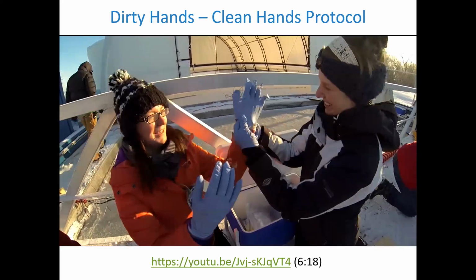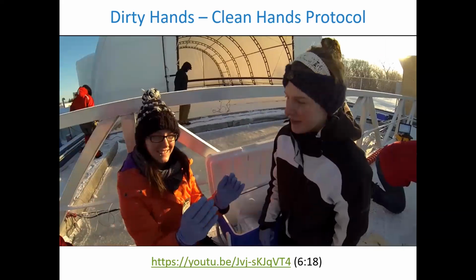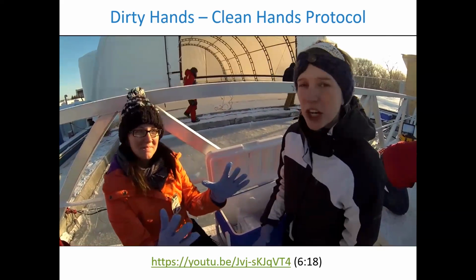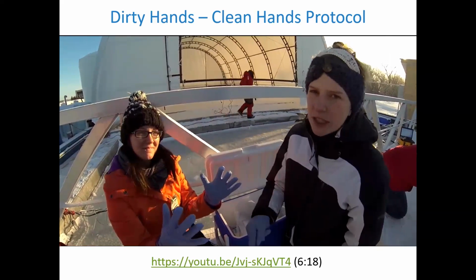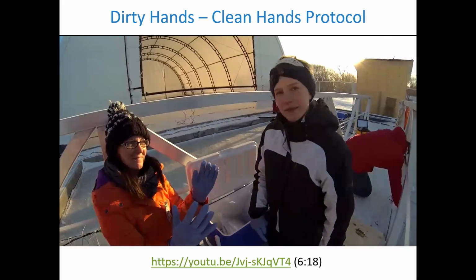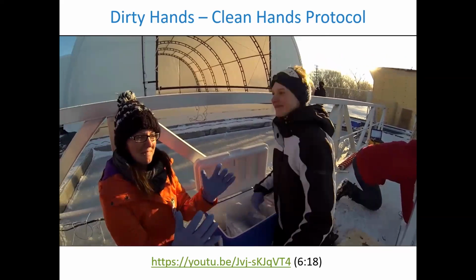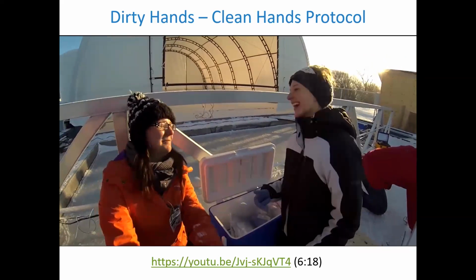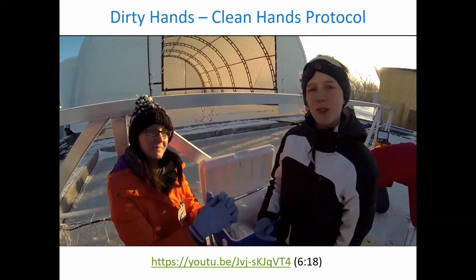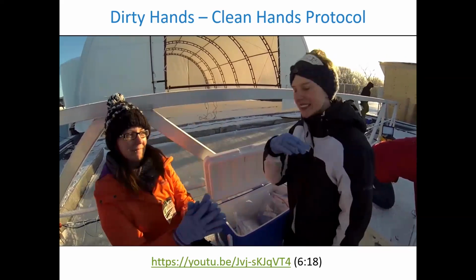There's a lot of activity this morning here at Surf. Now Amanda's already doing something she shouldn't be, and she's talking. When you're doing your sampling, make sure as dirty hands, your clean hands person is not talking. You can yell at them, you can point at them, just make sure they're not talking as much when the sampling's going on. And why shouldn't I talk, Sarah? You shouldn't talk because even breathing on the samples can introduce a source of contamination. Especially if you're a smoker, which is super gross.